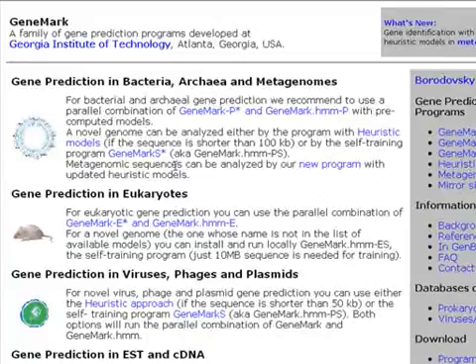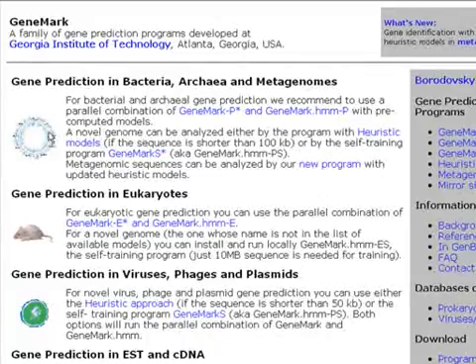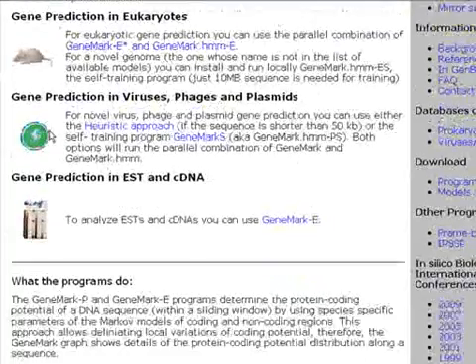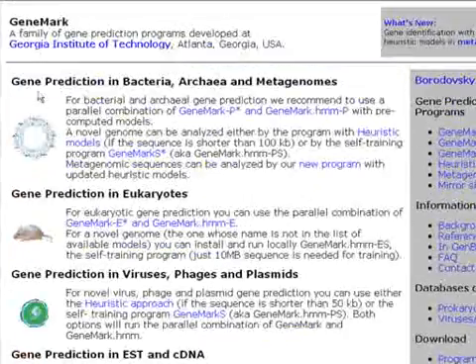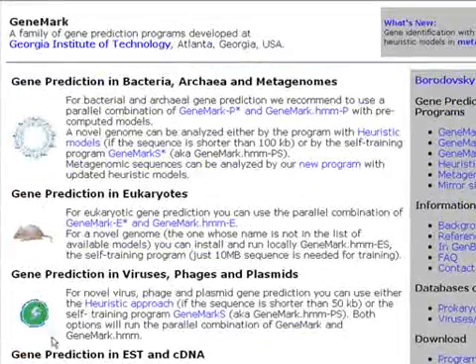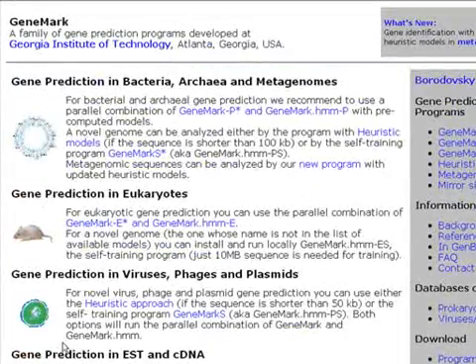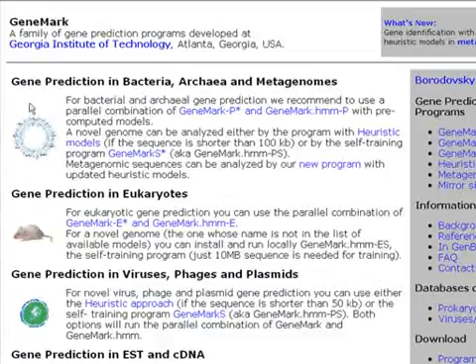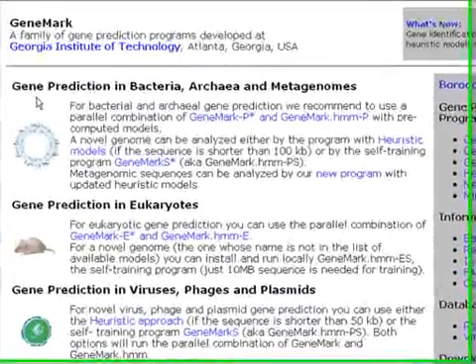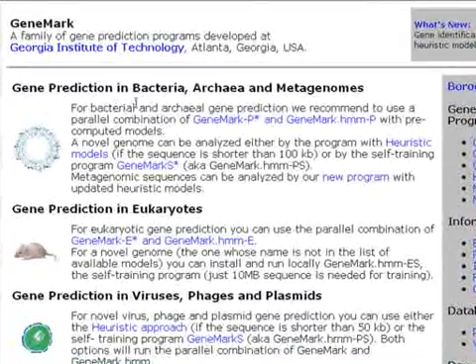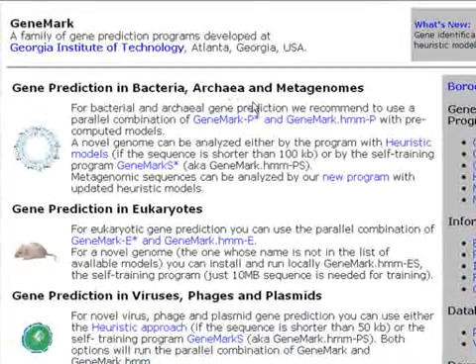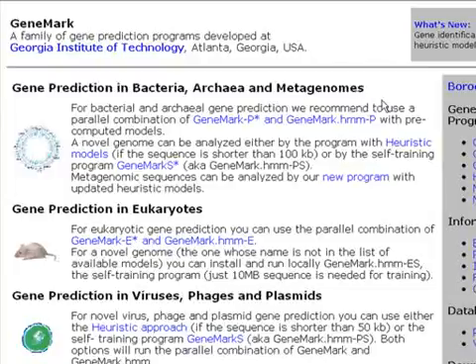This is our main page. We have four choices here or four distinct programs. The first is Gene Prediction in Bacteria, Archaea and Metagenomes program.